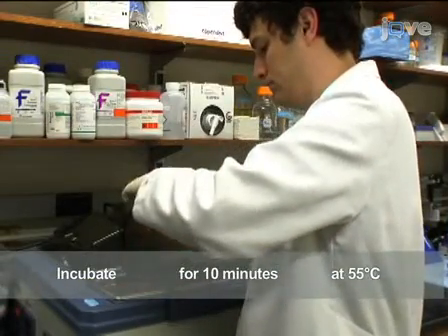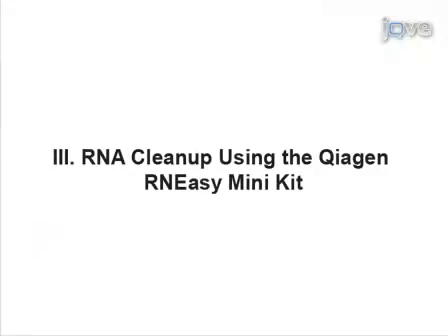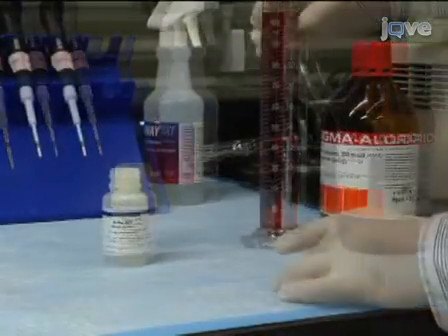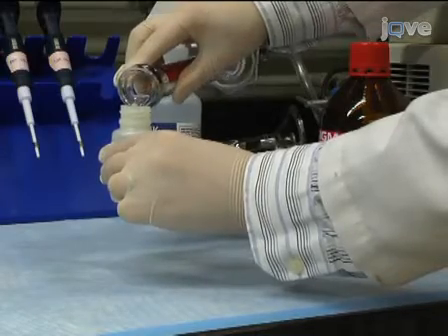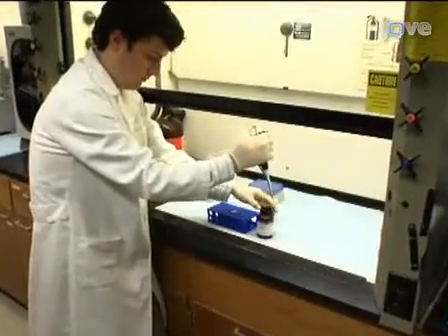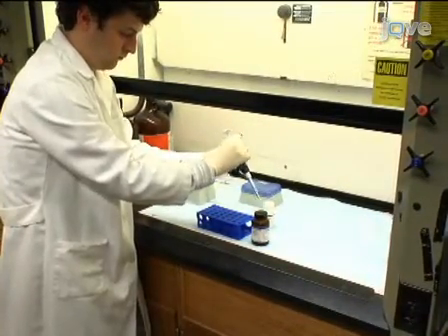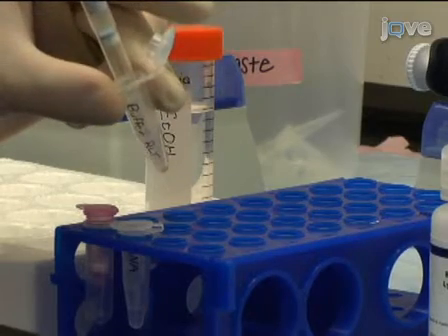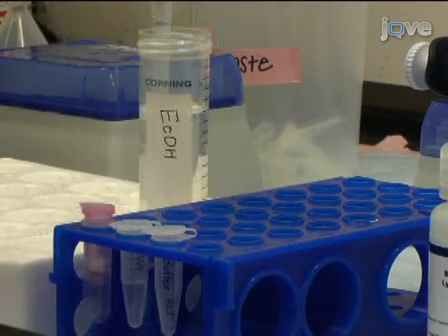Now that the RNA is extracted from the embryos, proceed to RNA cleanup and DNase treatment. To clean the RNA, start with the Qiagen RNeasy mini kit. Upon first use, add 4 volumes of 100% ethanol to 1 volume of buffer RPE. Working in the fume hood, add 10 microliters of beta-mercaptoethanol for every 1 milliliter of buffer RLT. Then add 350 microliters of buffer RLT and 250 microliters of 100% ethanol to the sample.